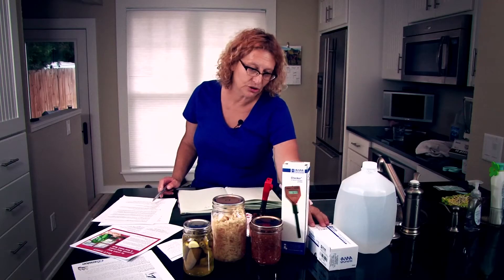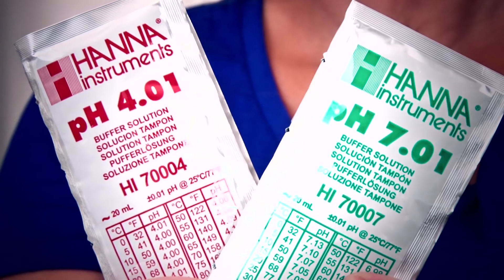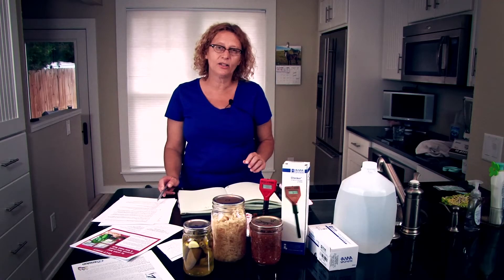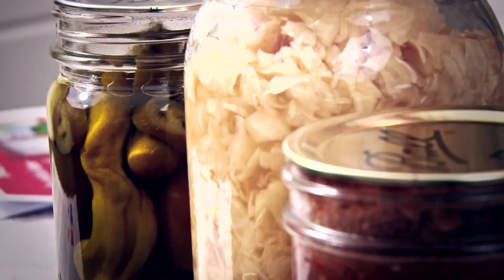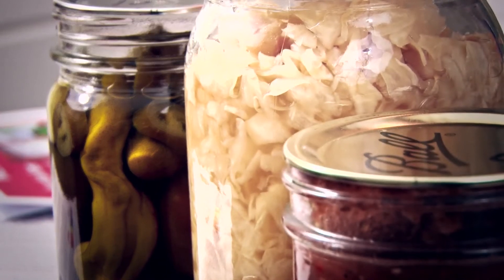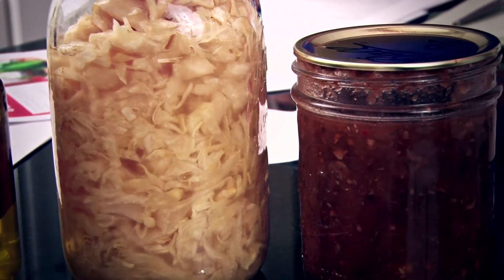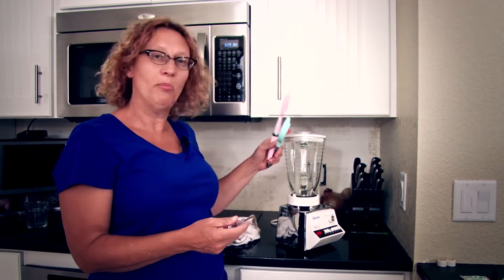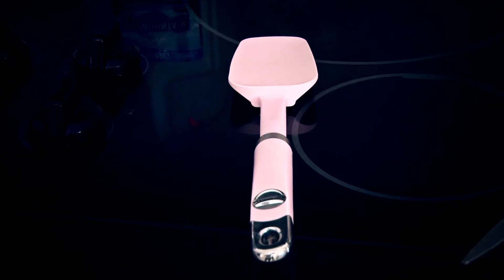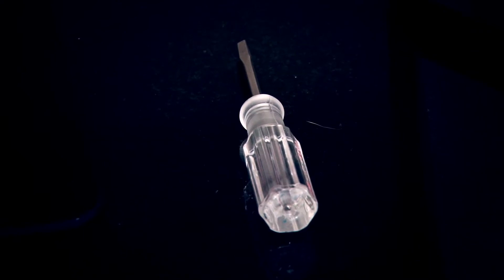You'll also need buffer solution in both 7.01 and 4.01 to calibrate your meter. You'll also need a couple of small glass containers in which to put your buffer solution. And of course, you're going to need some canned goods. You do not want to use things that you've just pulled out of a hot water bath — you want to allow them to cool properly, seal properly, and then use everything at room temperature when you begin your test. You'll also need a good blender, a spatula, scissors to open the pouches, and a little tiny screwdriver like the one you would use for fixing your eyeglasses. This is a Hanna Instruments meter that costs about $33.